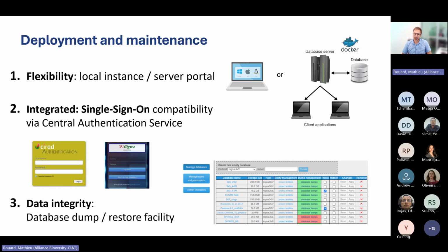As well, in terms of data management, there are a number of interfaces that are quite useful. This is what you can see here. You can manage different databases, and you can make dumps of the data. So just in case there is a crash or you have a problem, you can restore the information quite easily, and you don't have to rely on IT to do that. It's a good practice to do your own management of the database and restore when you need to, before there is a more serious problem on a server, for instance.